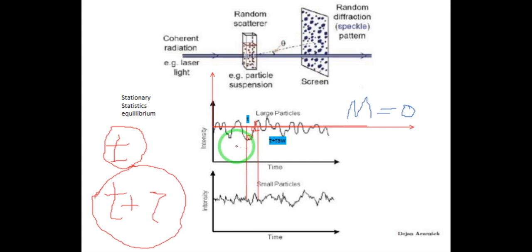Okay, so we can change the amount of tau within this period, within this range. And it gives us the information of the time that it will take for the particle to fluctuate.